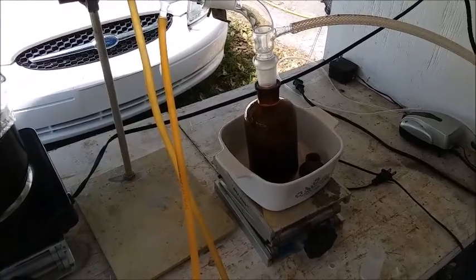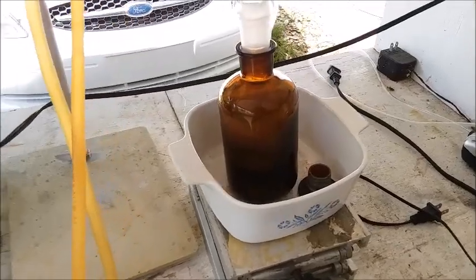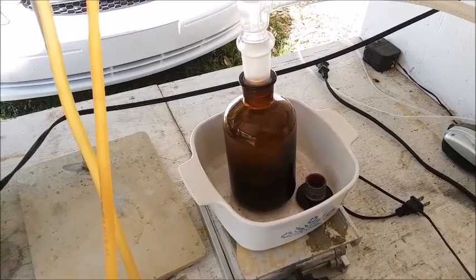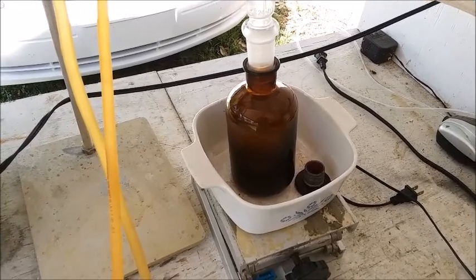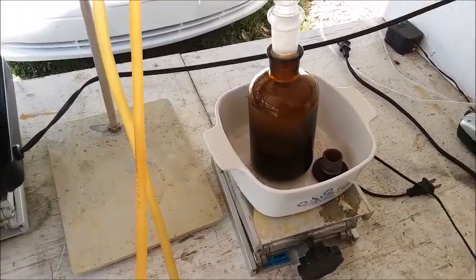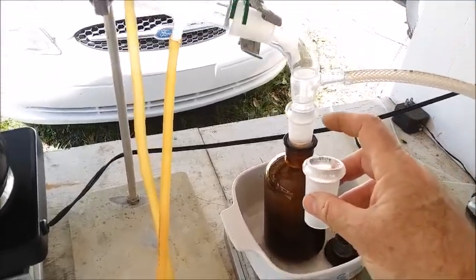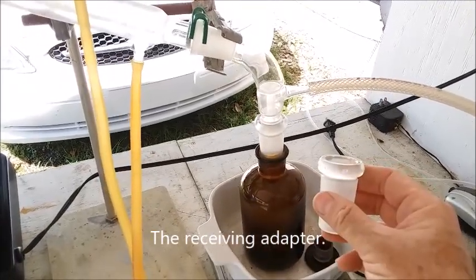I made another change. This is my nitric acid storage bottle — it's got a ground glass lid on it. What I'm doing is instead of putting the acid in a receiving flask like I've always done in the past, I am putting it directly into the storage bottle. I've got a couple of adapters that go from 29/42 to 24/40, so this goes in the bottle and then the end of that piece goes in there.